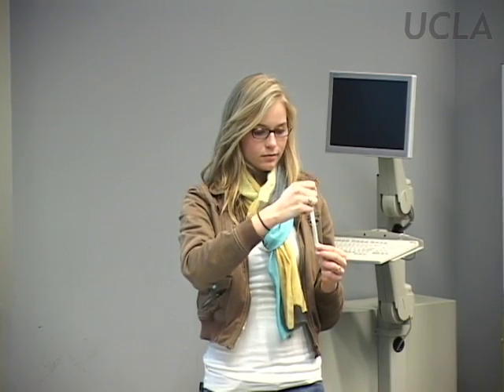Okay, and once you're done, you can put it back in the container. Don't rub the side of the container. Put it in straight like you're threading a needle. And once you're done, pass them to the right, and we'll collect them and do the PCR, and you guys can see the results later.